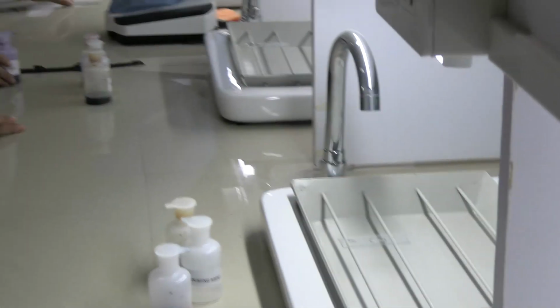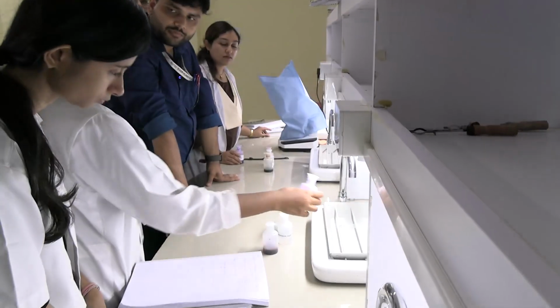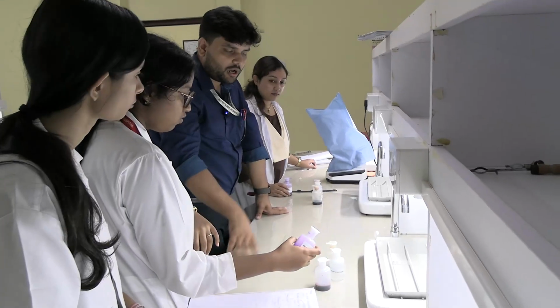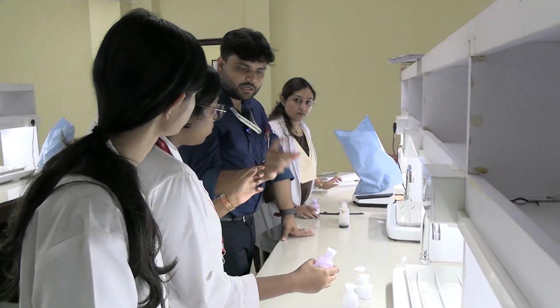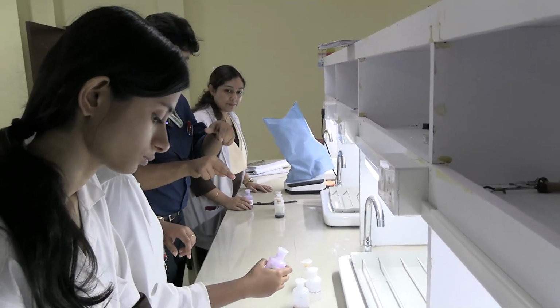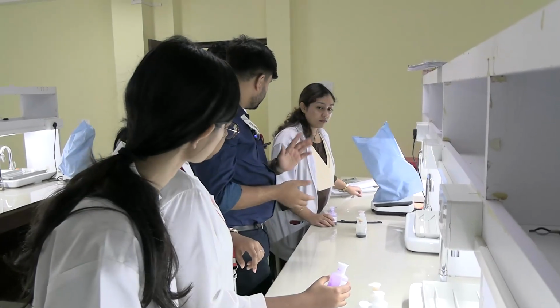So we will start, and what is the first step? Primary stain first for 1 minute. For 1 minute, okay? Then we will rinse it underwater. How do you rinse it underwater? In a sliding position, you will hold it with the thumb and the middle finger, and you will direct the water through your index finger onto the slide, not directly on the slide, otherwise the whole smear will get washed away, okay?